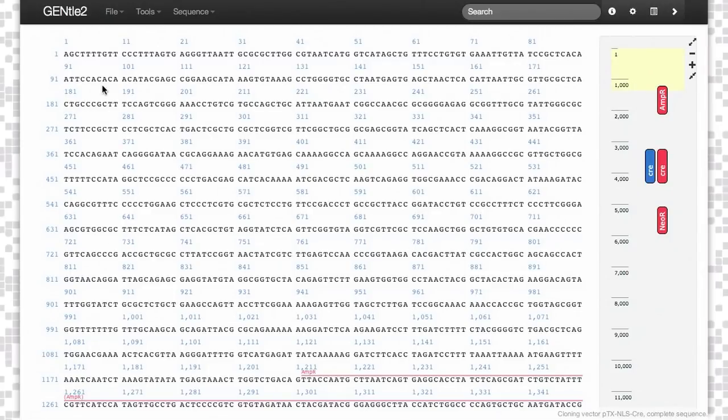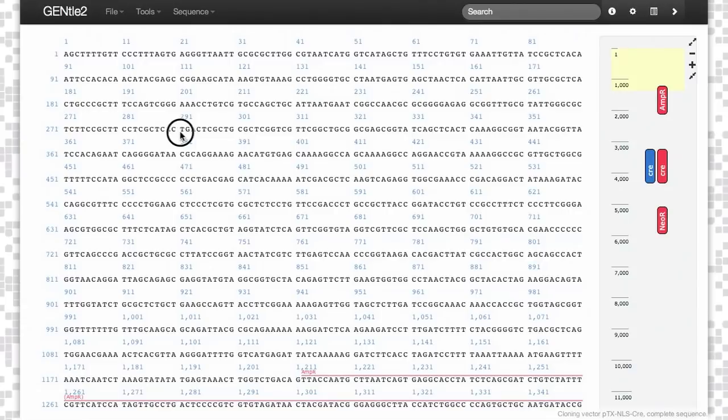You can annotate comments or annotate your DNA based upon its functional capacity by highlighting.